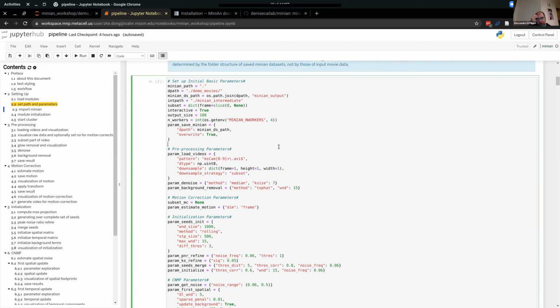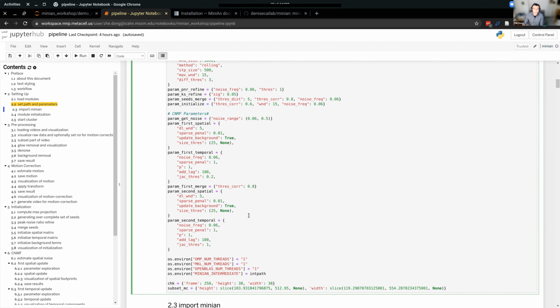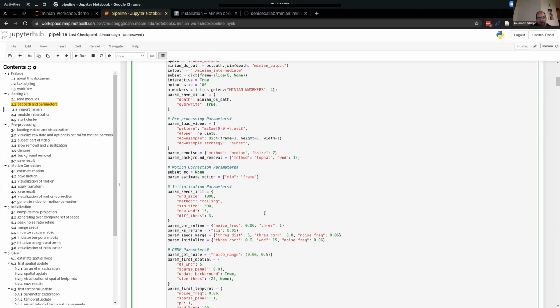The way that I did it, I didn't change this dtype, but for example, you can easily put another cell before this and define, for example, the data path, or change your window size. What Papermill will do is inject these parameters. That is definitely possible. So we had to give up the ability to change some variables. Probably not everything is changeable. Yes.